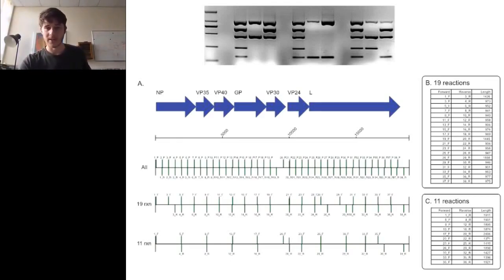this project. So the way that we decided to do it was to design primers which would cover the entire Ebola genome. So Ebola is a small RNA virus, which means it uses RNA as its encoding its genome. It contains only 7 genes, which are represented by the blue arrows, and is only about 18,000 bases long.